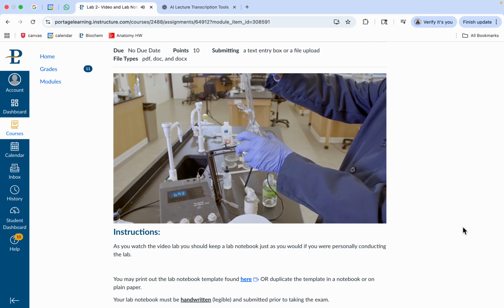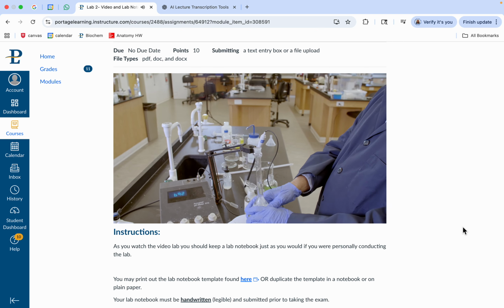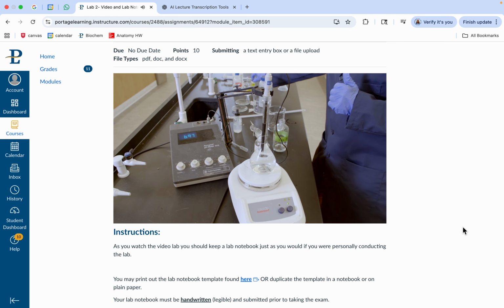And then we can add some water in to a fill line that's in the glass. There's a little line there, and when you get to that line, it's exactly 250 milliliters. Then we can also test that we're at about pH of 7, right? Again, 6.97 or so, that's really good. So remember, this is a buffer, and a buffer really helps to maintain the pH.